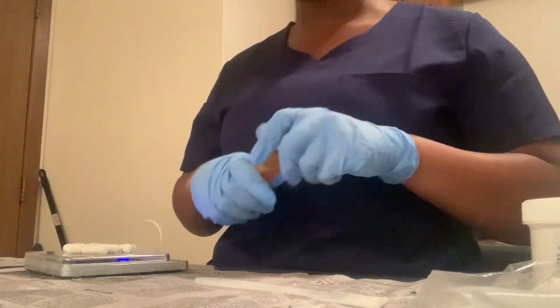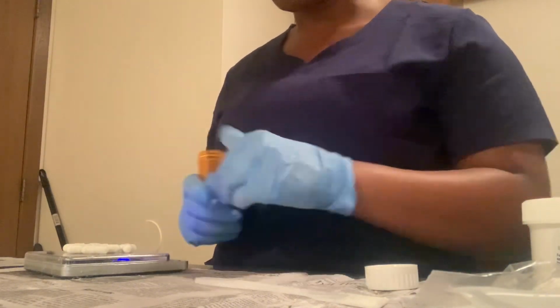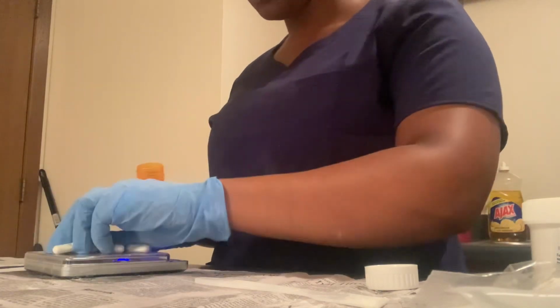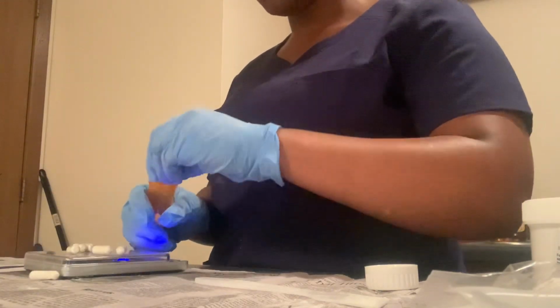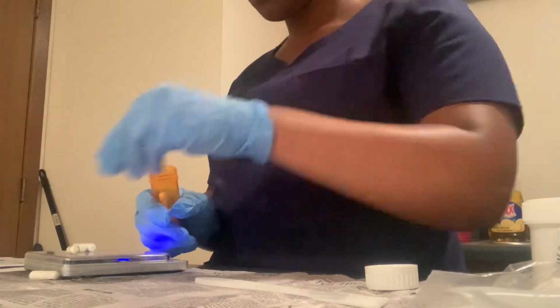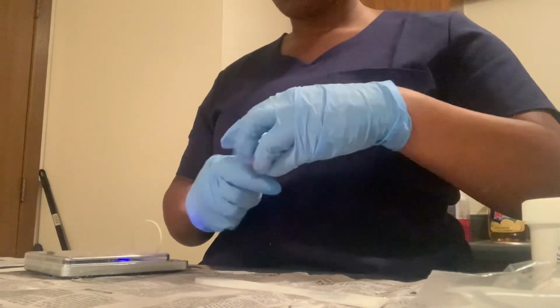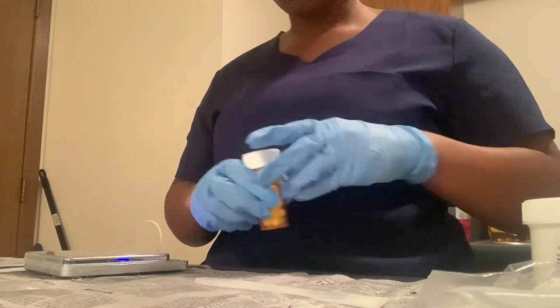Package our prescription. So our 10 capsules, we're going to put inside of this bottle, and then we're going to label the prescription. So we got our 10 capsules. Put it inside of here. And now we're going to label them.